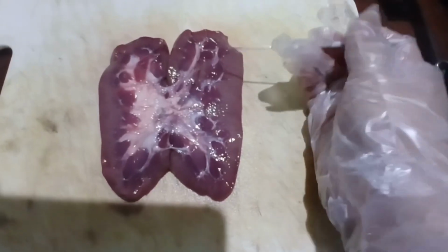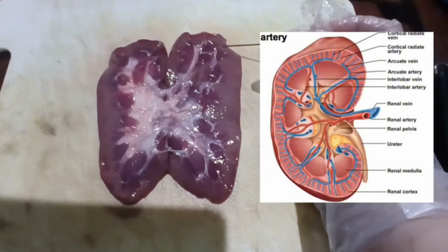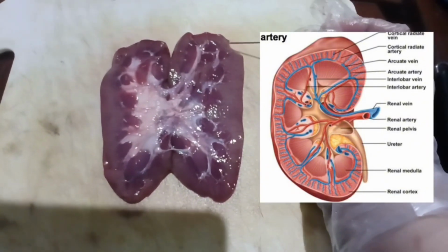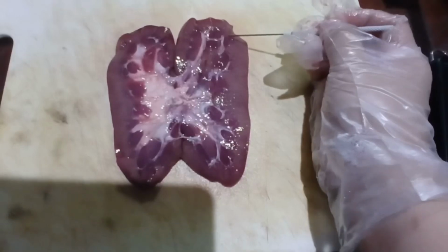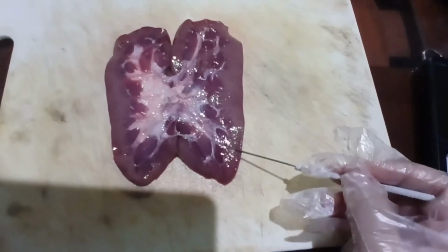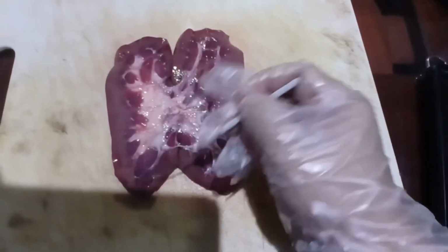Next, we have the cortical radiate artery. As stated here, this artery radiates outward from the arcuate arteries into the renal cortex. So here is the renal cortex. Again, this is the renal cortex on this part.